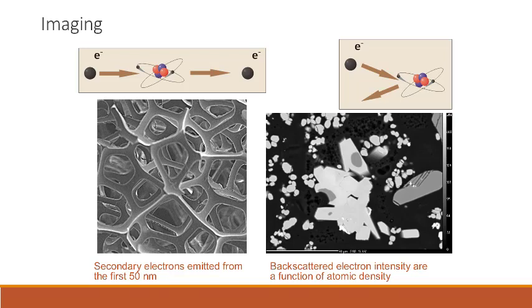It's not very interesting for a flat sample, but for a sample with some relief, it can show some dramatic things at a scale beneath that of an optical microscope. For example, the picture we're seeing here is a volcanic foam generated in Hawaii from an eruption. Volcanic bubbles pushed small amounts of magma to the outside edges, leaving them as an interconnected glass upon cooling. And that's what we see here, a three-dimensional framework of the glass left behind around the bubbles.